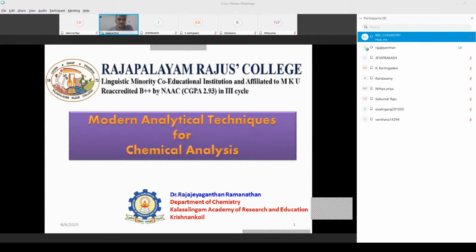Today, the topic of the webinar is modern analytical techniques for chemical analysis. We all came across a lot of spectroscopic techniques which use a wide spectrum of electromagnetic radiation. For example, we use ultraviolet radiation in UV spectroscopy, infrared radiation in Fourier transform infrared spectroscopy, radio waves in nuclear magnetic resonance spectroscopy, and X-rays in X-ray diffraction and X-ray photoelectron spectroscopy. But here we are going to learn about a new spectroscopy based on synchrotron.